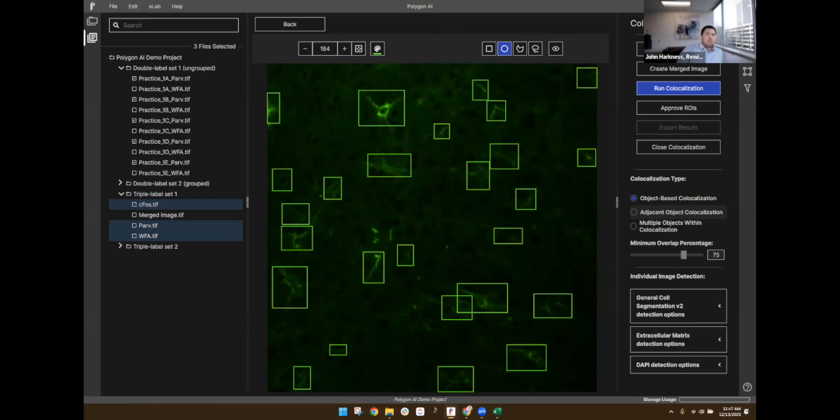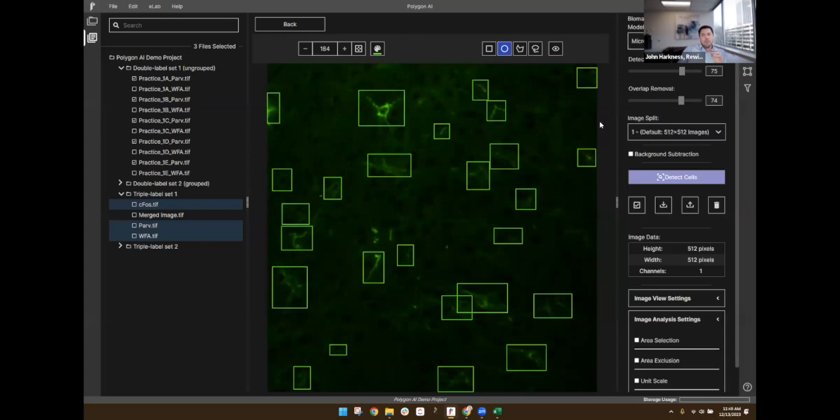And just a follow-up on that, an additional feature that we have coming out, hopefully sometime soon, is the ability to import those ROIs. You can already import ROIs into Polygon. Maybe Christy, if you don't mind showing that button on the analysis panel. This is a way that you could bring in a standard ROI shape for area selection if you've created one previously.